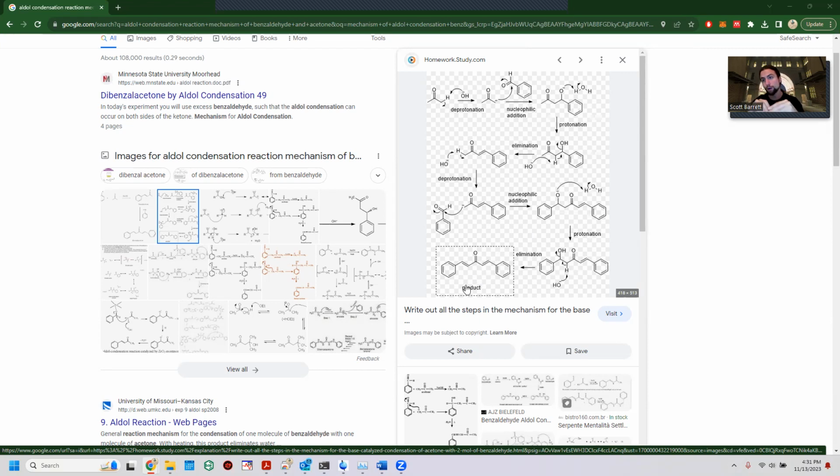Now, the other part of what I wanted to tell you about the NMR is if you ran a carbon NMR in this case, then there would be significant differences, especially with those double bonds, because you have 1, 2, 3, 4 groups there. So you're going to have 4 peaks relative to that. And they're probably going to overlap because it is a symmetrical substance. So since it's symmetrical, you probably only have 2 peaks, one at the alpha position where that double bond is and one at the beta position. That's the big significant difference. And also, you would not have an aldehyde carbonyl peak that you would see in a benzaldehyde. There would not be that there. However, there would be a ketone carbon peak in your carbon NMR.